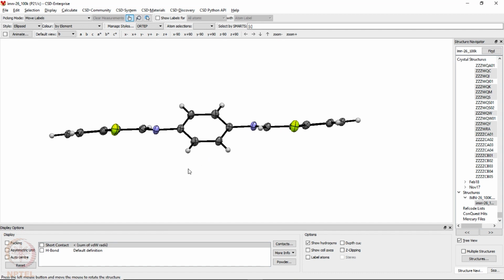See, a single crystal is grown from a starting bulk material that was a polycrystalline powder to start with. What we have done is taken that powder, dissolved it in a particular solvent, and then tried to evaporate the solvent slowly at about 4 degrees centigrade in a refrigerator or at minus 20 degrees centigrade. In this process, the solute-solvent interactions are different based on what the solvent is and what the solute is.